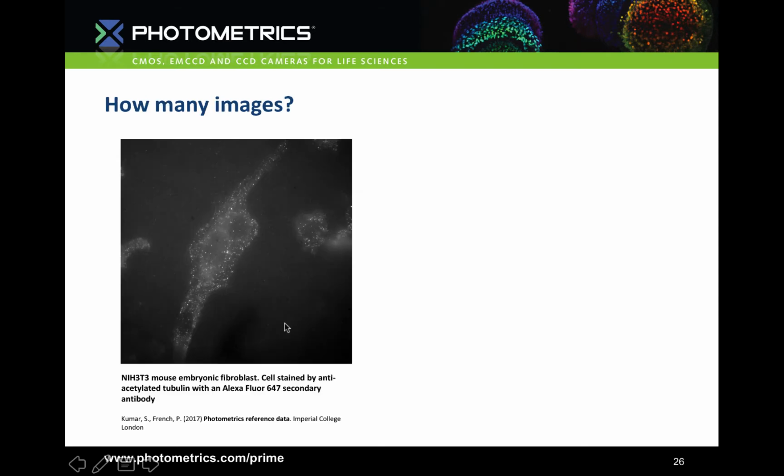In order to maximize molecular density, the researcher needs to consider how many frames of data are necessary for good super-resolution imaging. This is a video of STORM data and represents 1500 frames playing at 45 frames per second. 1500 frames is about a tenth of the amount of frames you would need to even start having good enough frames for good quality data. Mostly you'll be looking at closer to 30,000 frames. So using a standard exposure time of 30 milliseconds, 30,000 frames would take 15 minutes to acquire.